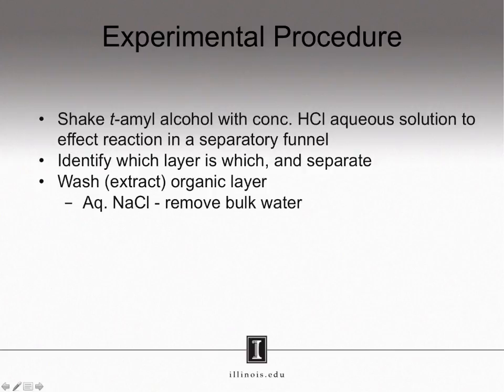What a brine solution does is, in the same way that biological cells can have water leave or enter them as a result of salt concentration inside or outside of the cell, a brine solution is saturated in salt, and as a result, any water in the organic layer will leave the organic layer in order to dilute the salt in the aqueous layer. Once you have removed any bulk water present, you will then add in an aqueous solution of sodium bicarbonate in order to remove any remaining acid. Remember, sodium bicarbonate is a base.